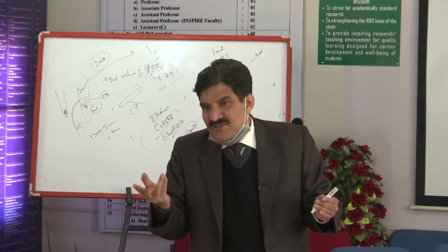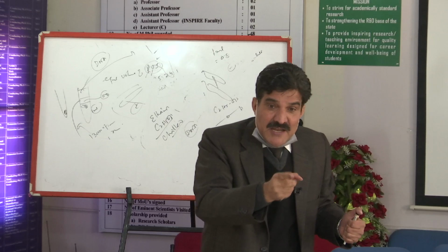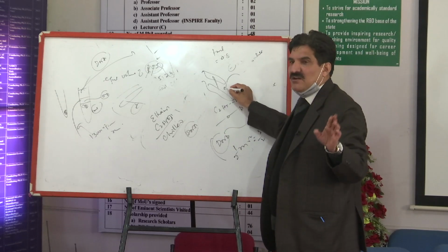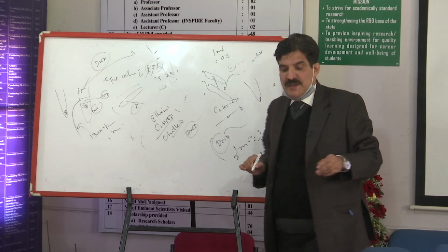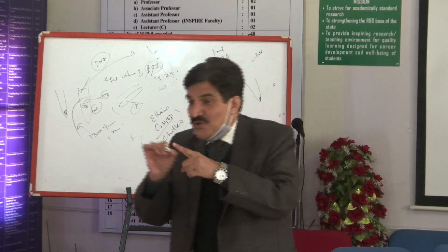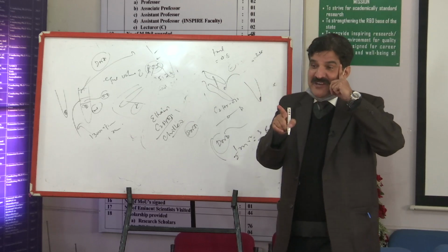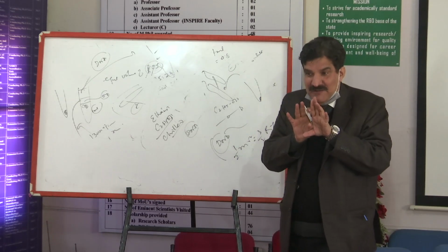But maybe some acid or salt will also be there, or not? So you take the precipitate, then you wash this precipitate. When you leave the alcohol out, there will be precipitate at the bottom of the tube. This precipitate may be containing some salt ions. You are going to remove salt ions, but you have to keep in mind DNA should not be in dissolved form. It should be as precipitate, and only salt and other small molecules should come out.